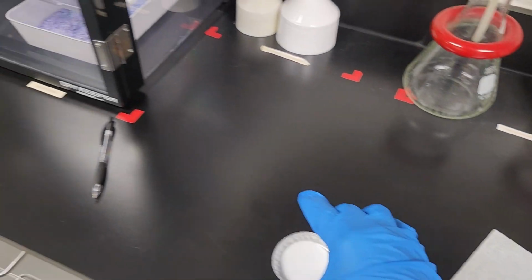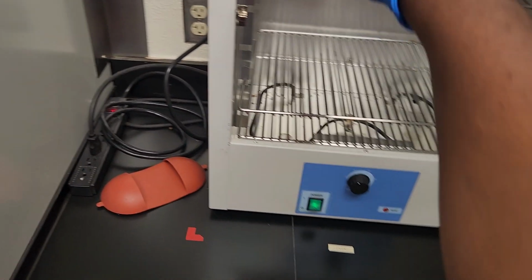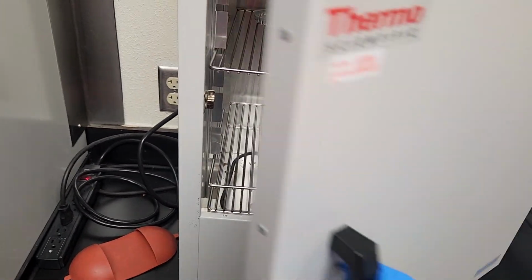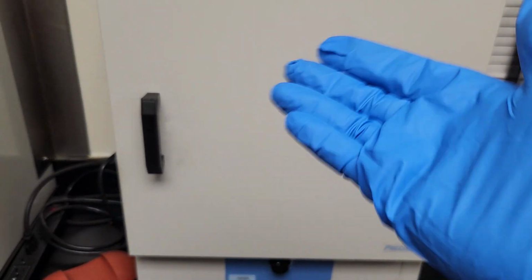I will take it to our oven. Our oven has already been preheated to 103 to 104 degrees, so we put it inside. Depending on your facility, some will leave it for 1 hour, some 2 hours, depending on your facility procedures. You just have to follow that. So now we'll wait for 1 or 2 hours.